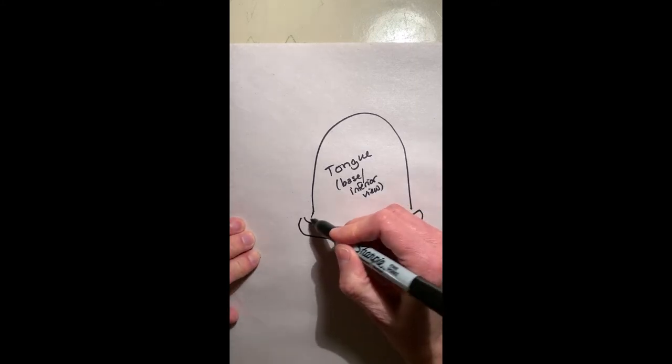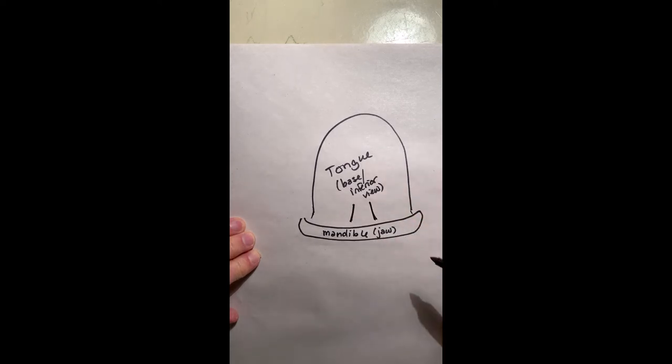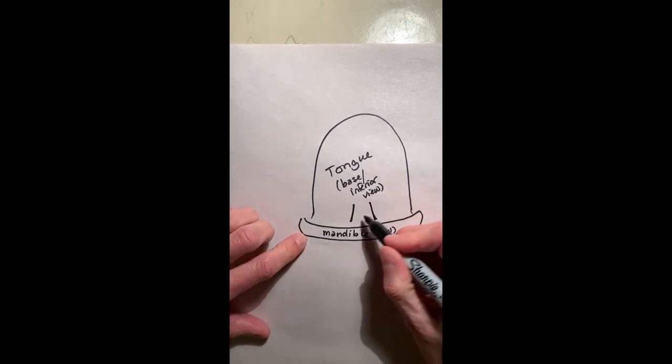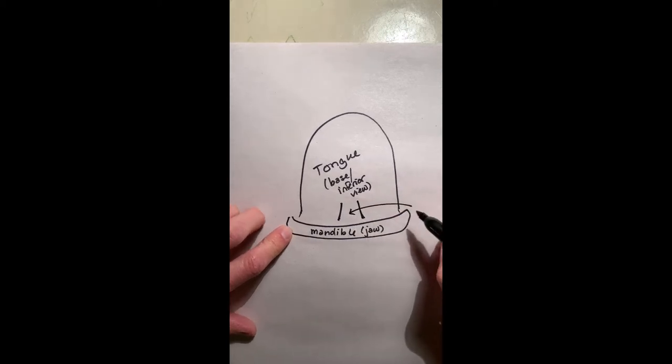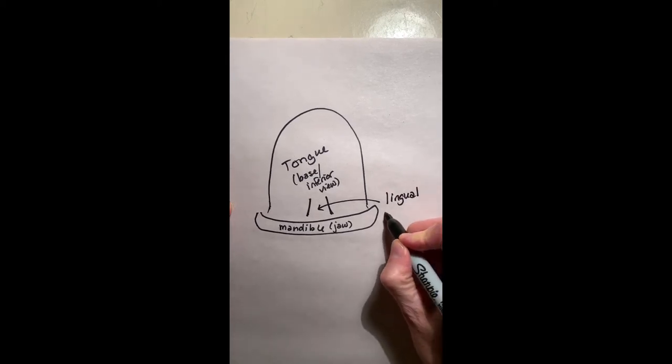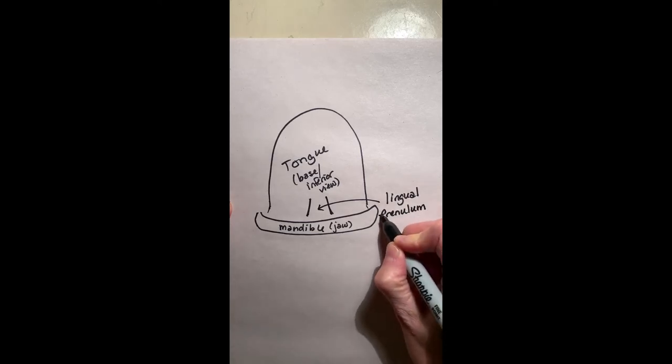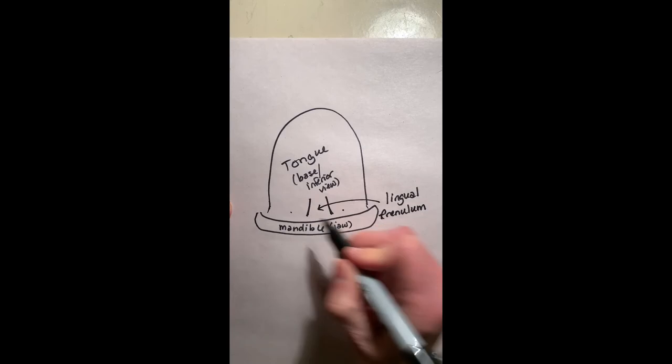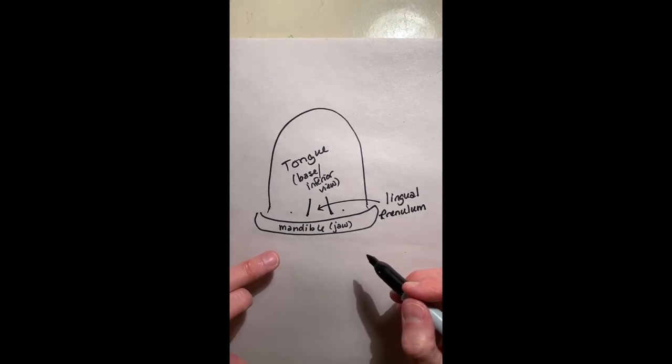The thing that's holding the tongue to the mandible is a piece of tissue that you have on your tongue underneath when you look, and you can see it pretty easily. It's called the lingual frenulum. You'll see that there are salivary ducts on either side of it. The lingual frenulum is just a piece of tissue that connects the tongue to the floor of the mouth.